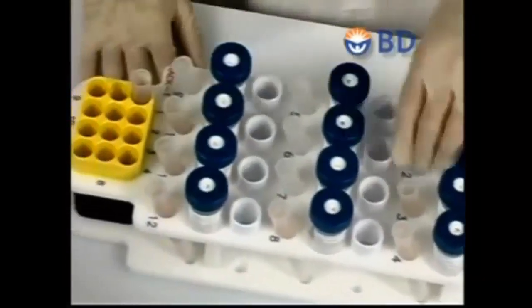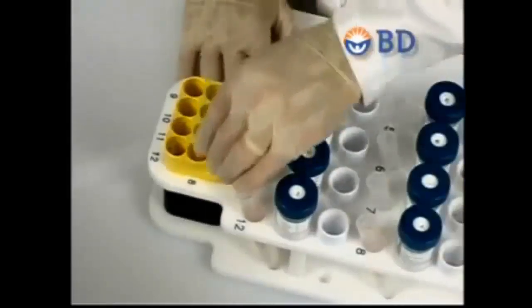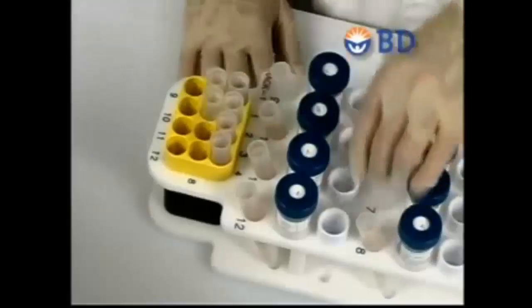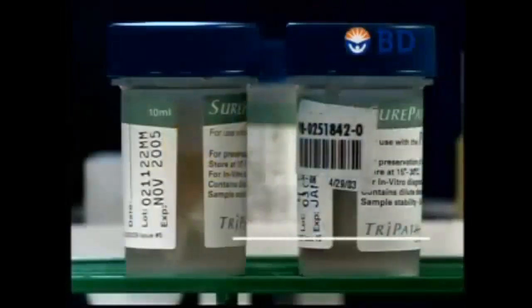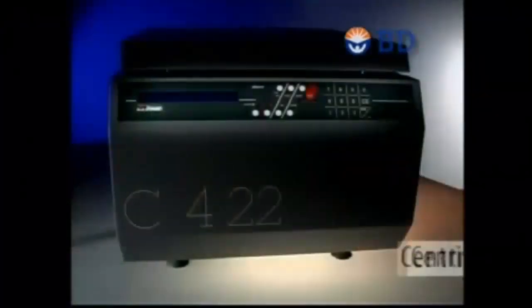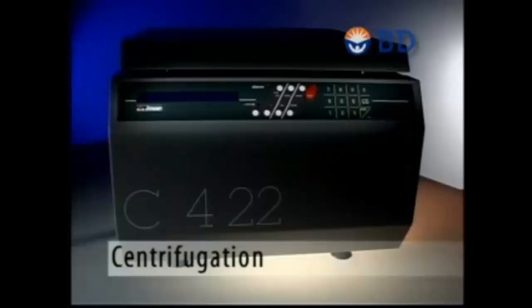After the PrepMate cycle is complete, the centrifuge tubes are transferred to the centrifuge bucket for processing. This process takes approximately 3 minutes per tray of up to 12 vials. The 2 milliliters of remaining sample within the SurePath collection vial can be immediately stored or redirected for additional testing. A pre-programmed centrifuge is provided with the PrepStain system and can be used for both gynecological and non-gynecological applications.